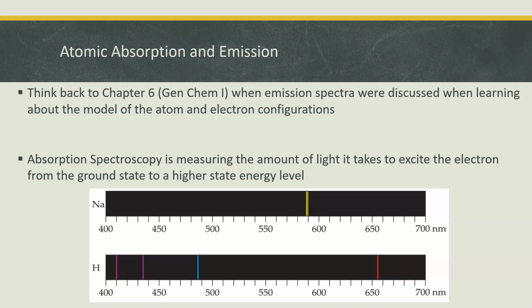Okay, so that's kind of what we're using to do this, is that each element has specific wavelengths that they can absorb and then emit, and we're able to, as long as we excite the electrons to a higher energy state and let them relax back down.